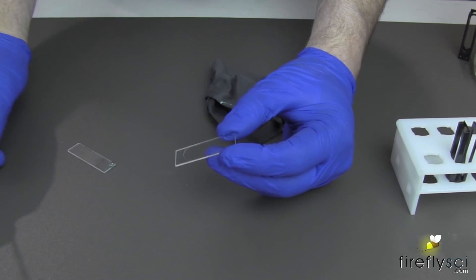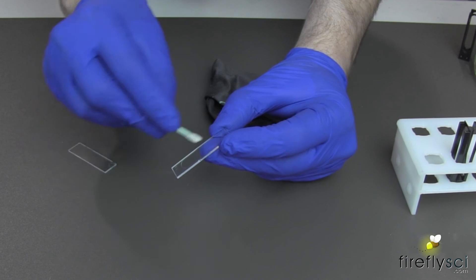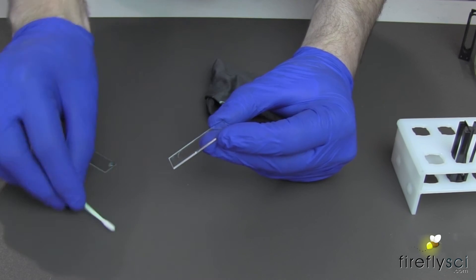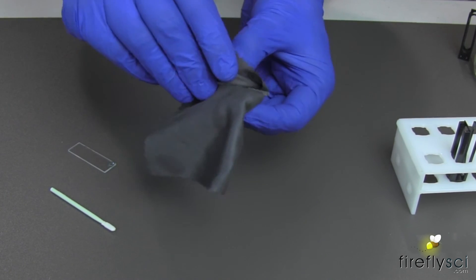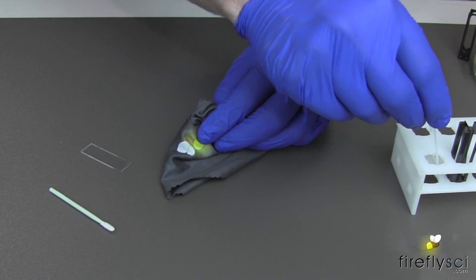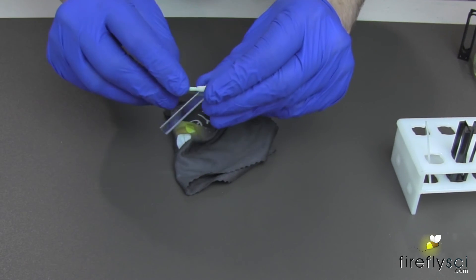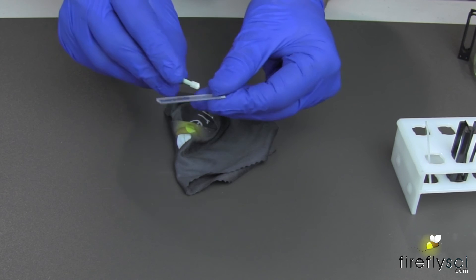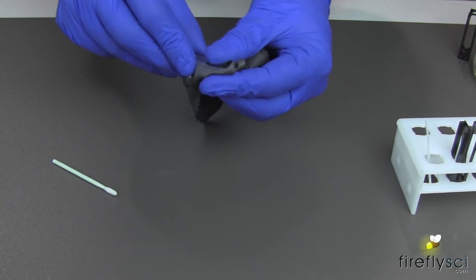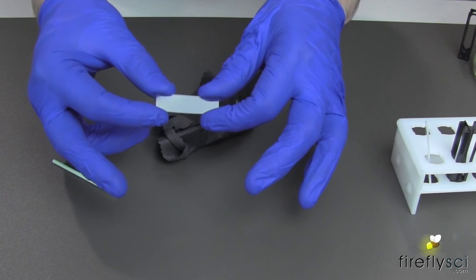Then we'll take our lens cloth and get it all right off. What I like to do is take a cleaning swab that's been dipped in some alcohol and go right over that plate right away as soon as it comes out. Dry it with the lens cloth and put it right into the cell rack. We'll do the same thing with the cover plate — go ahead and clean it with alcohol on both sides, then give it a quick wipe with the lens cloth. All set to go for the next experiment.